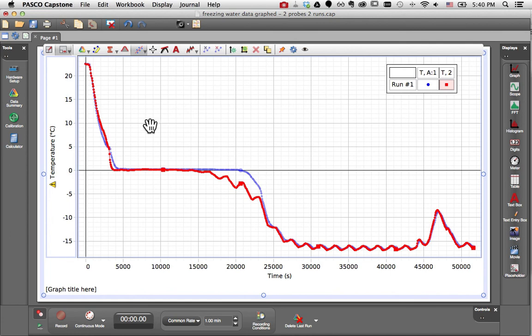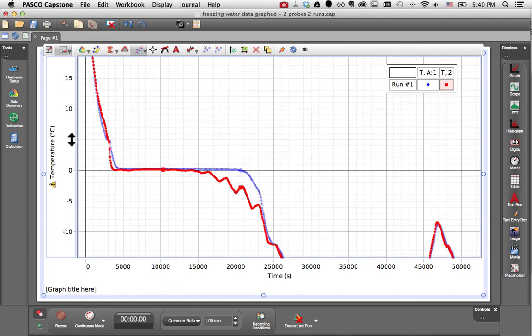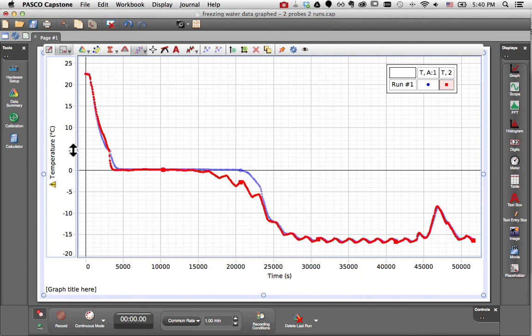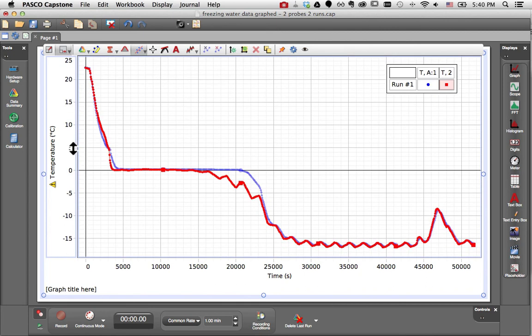The great thing about adding a similar measurement is that it ensures that you have a single y-axis, so you can always do visual comparisons between the two knowing that they share a common y-axis.